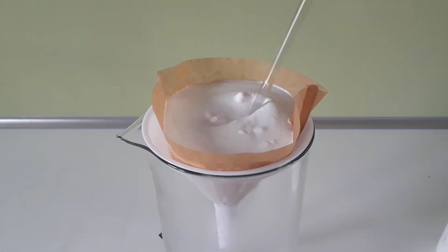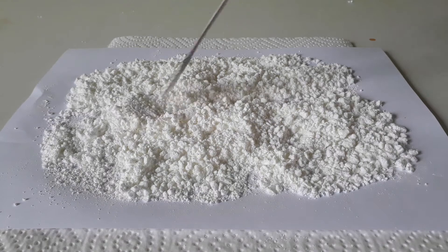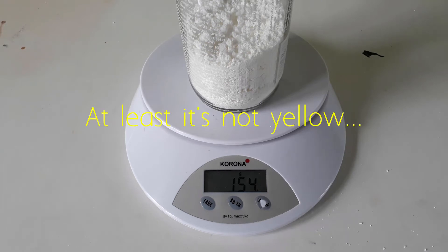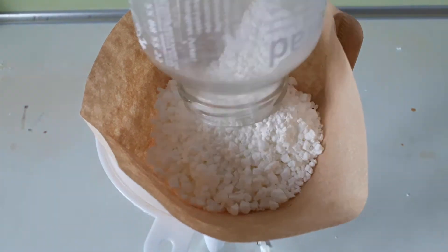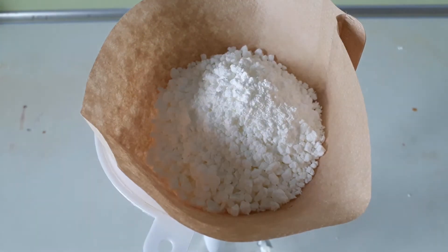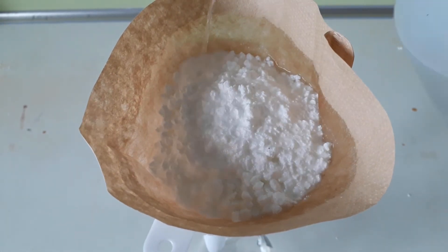After that, I filter the product, I dry it on a hot plate and I get a nice yield of... 123%. At this point I didn't have many options. I thought I hadn't washed it enough, so there was like 30 grams of excess sodium chloride in my product.